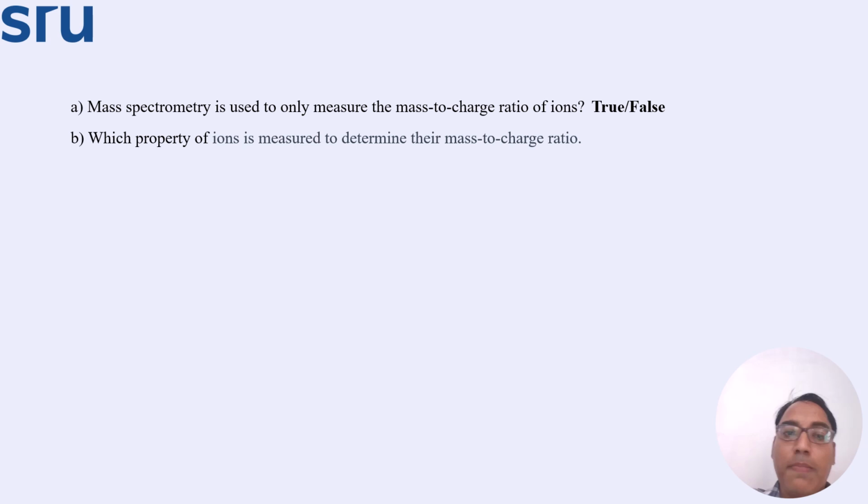What is the right answer? It is false, because we are identifying the protein based on mass to charge. Our objective is not to find out the mass to charge ratio only. Okay, that's just a strategy to find out the peptide fragments or discriminate them. Alright.